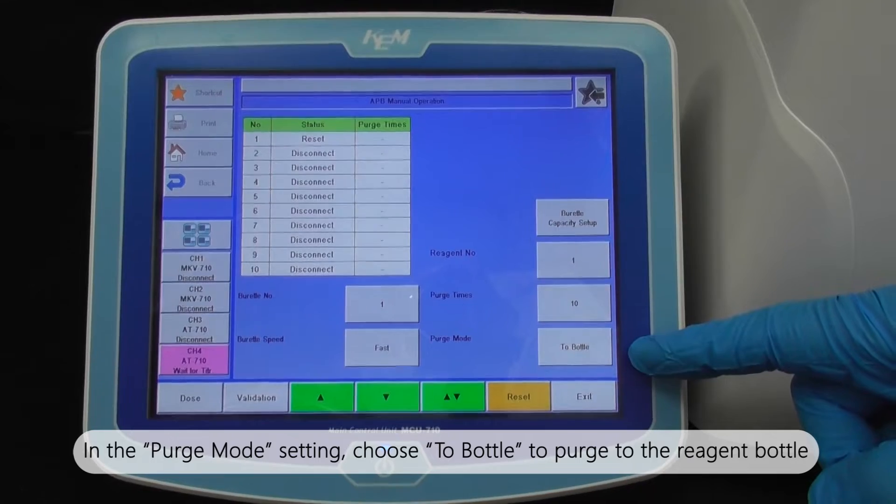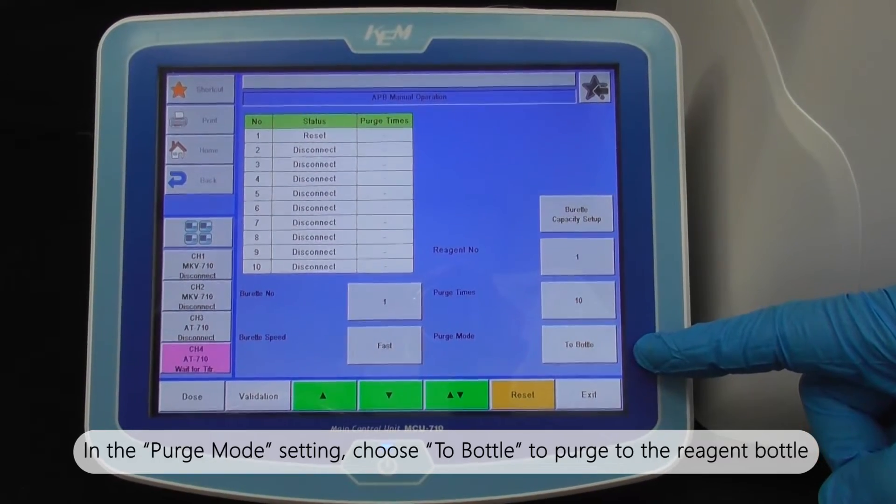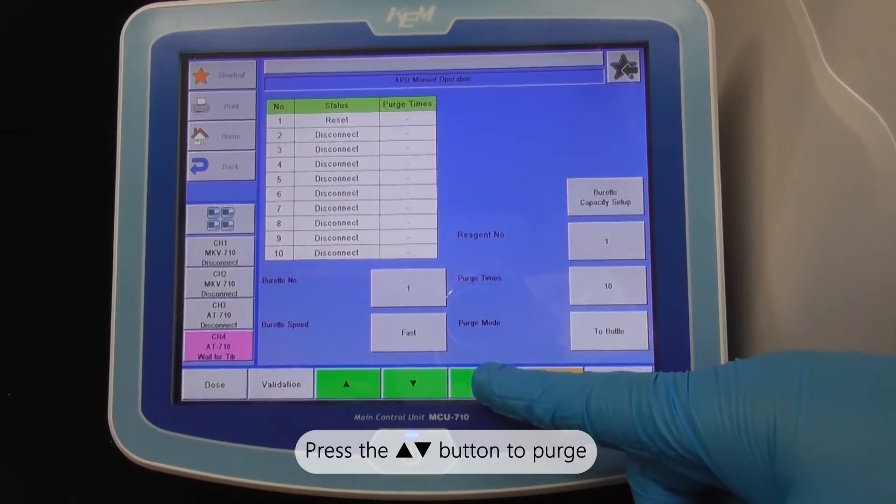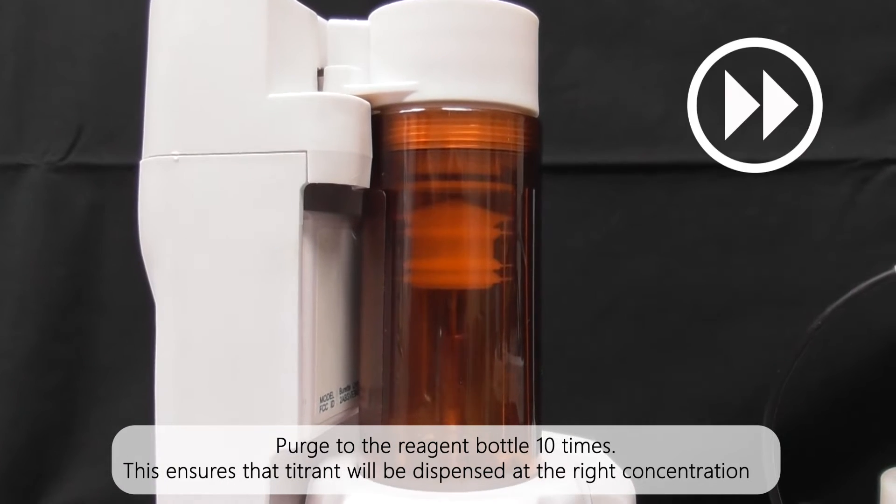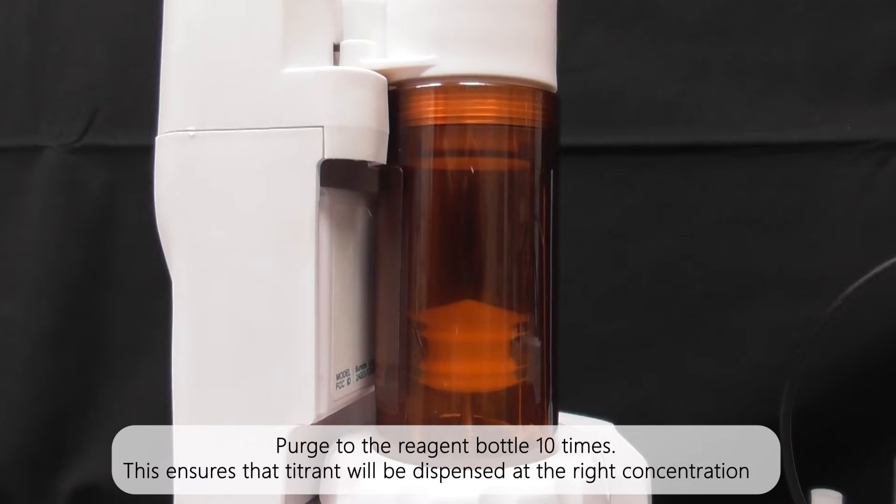In the purge mode setting, choose To Bottle to purge to the reagent bottle. Press the up down button to purge. Purge to the reagent bottle 10 times. This ensures the titrant will be dispensed at the right concentration.